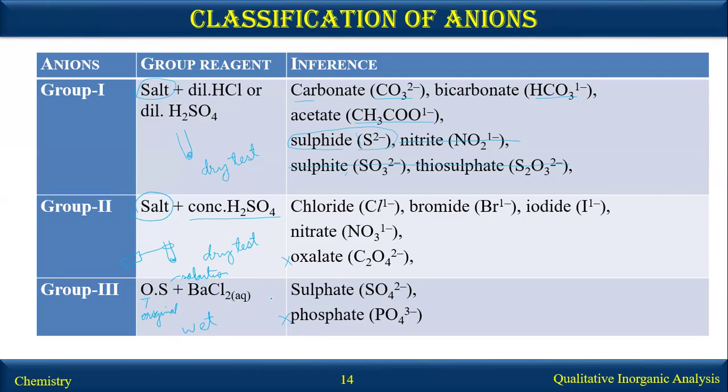Cold water means water at room temperature. But from this slide, you must remember all the ions, whether they are in your syllabus or not. These could be part of your Viva. You should remember that these are called dry tests, and these are performed directly on the salt.